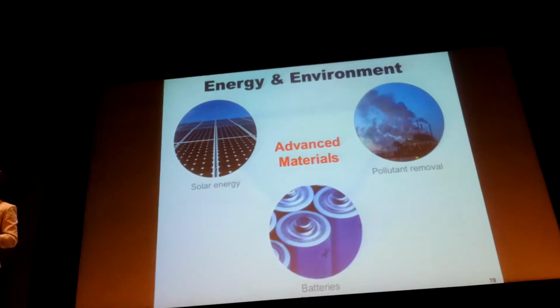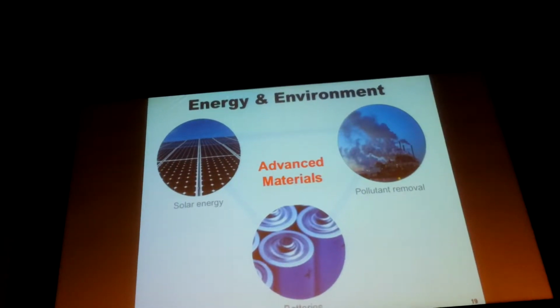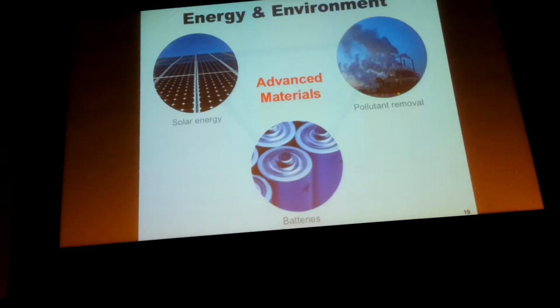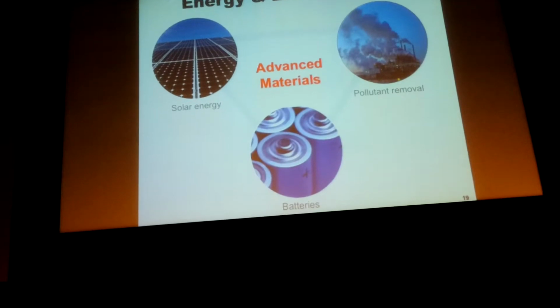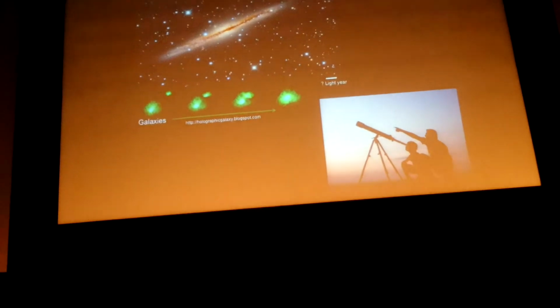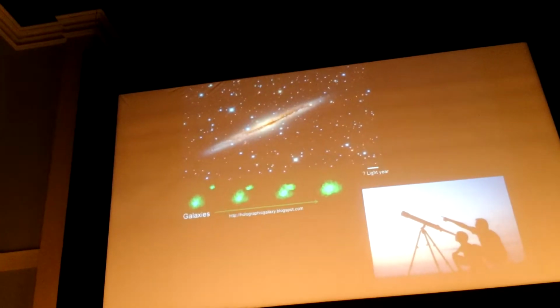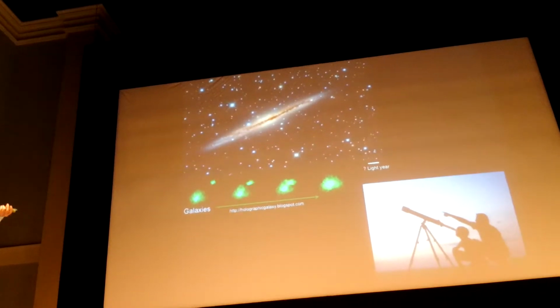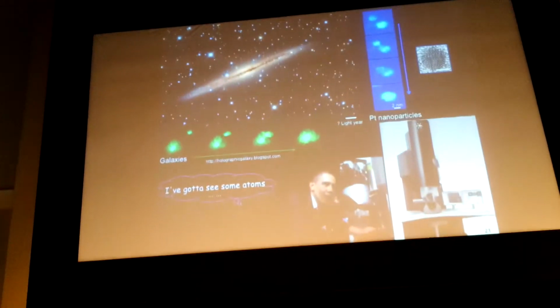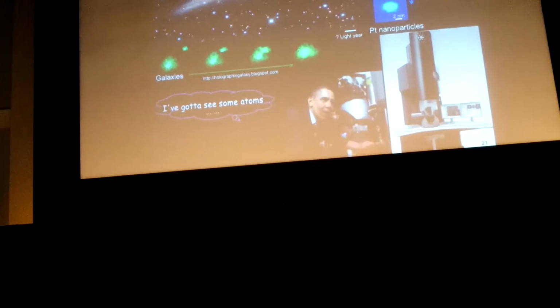As a material scientist, I'm interested in a variety of materials and materials processes in applications for sustainable energy and clean environment. I study materials at the atomic level. Scientists use telescopes to study the large matter, like stars and galaxies. I use a transmission electron microscope to study the smallest matter, the atoms.